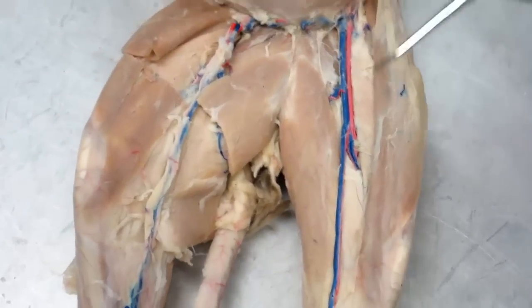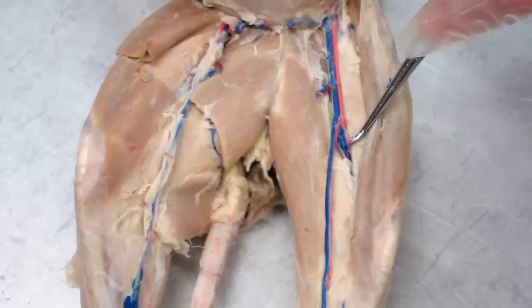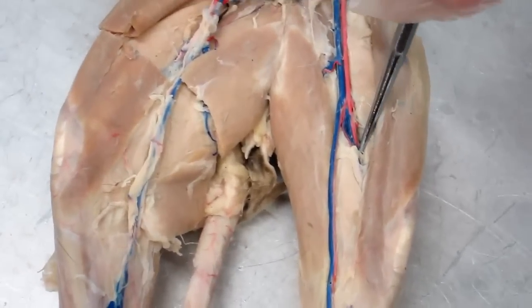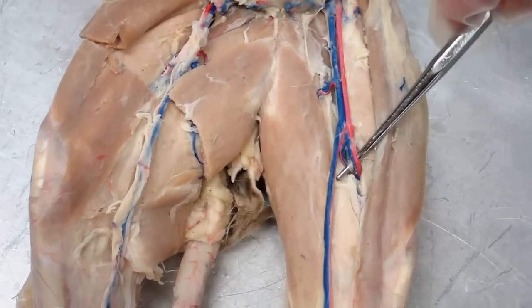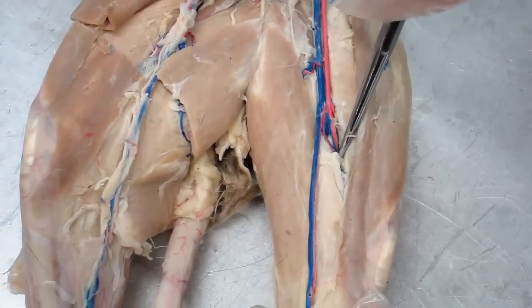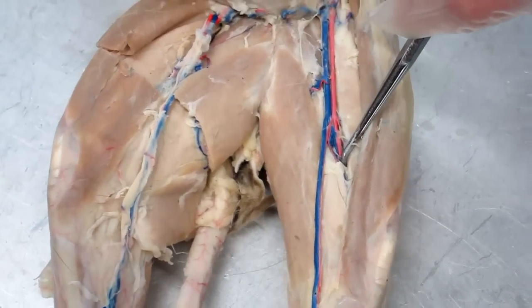Okay, as we get here closer to the knee, we can see that the femoral divides into branches. The two large branches that are heading kind of deep into the muscle here are the popliteal artery and vein, and the opening that they're passing into is the adductor hiatus.